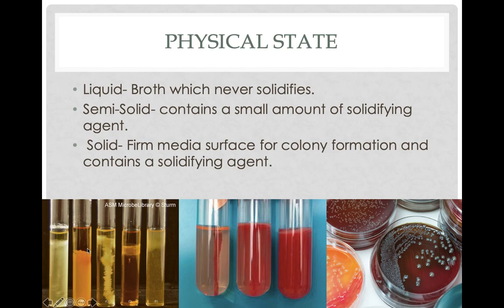You can see here, there's not a lot of bacteria towards the top. These guys don't like oxygen. These guys do like oxygen. They're all gathered at the top. These guys like just a little bit of oxygen. These guys can move around. These guys can't.